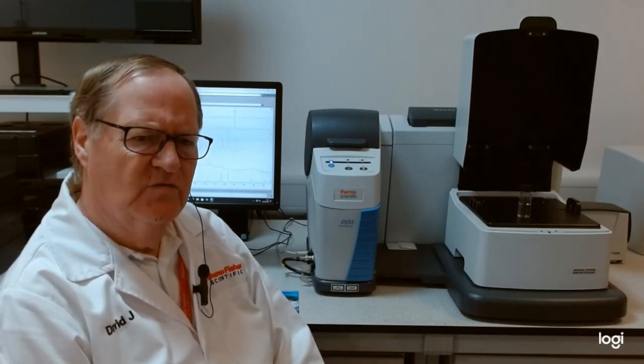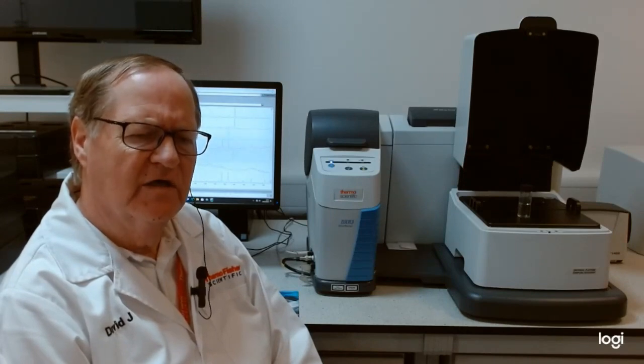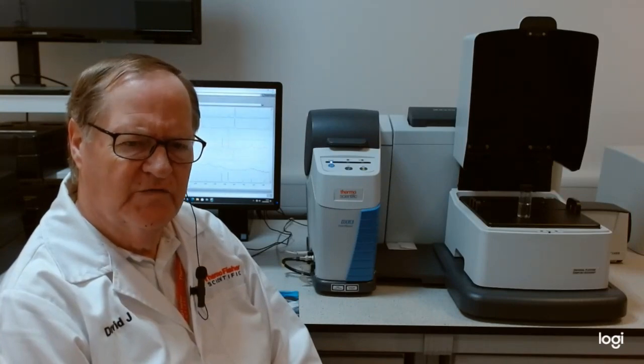The system can also be configured with fiber optics. With fiber optics in Raman, the rayleigh rejection filter is in the head of the fiber optic itself, and so what we have is a universal fiber launcher, which makes the instrument independent of the actual fiber used.